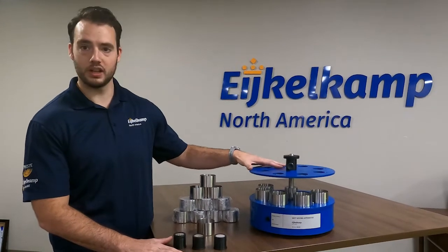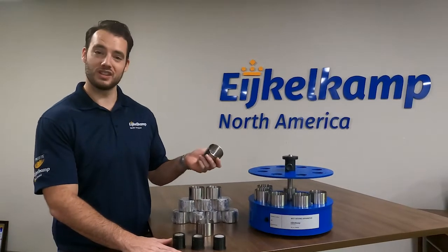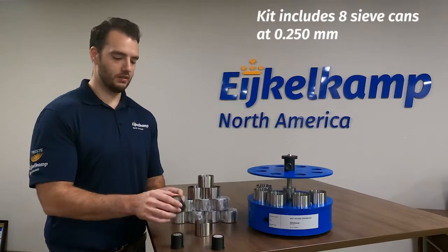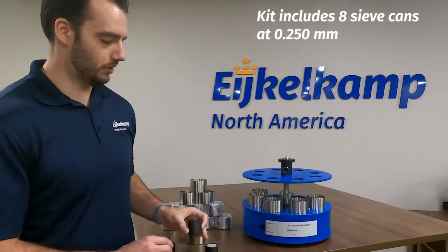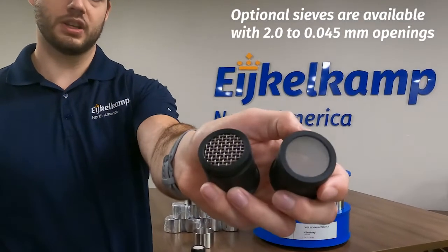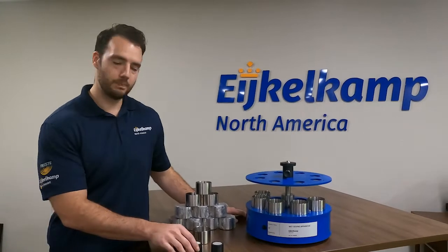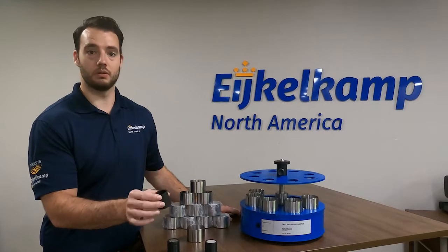What's going to come in this set? We have the shaking apparatus with a timer setting as well as a continuous mode. You're going to have 16 of these little stainless steel cups — two per test sample. It also comes with eight sieves. The standard sieve is 250 microns, but you can also have the option to do different sizes ranging from 45 microns up to 2 millimeters. It really depends on what type of soil and aggregates you're looking at for your application.